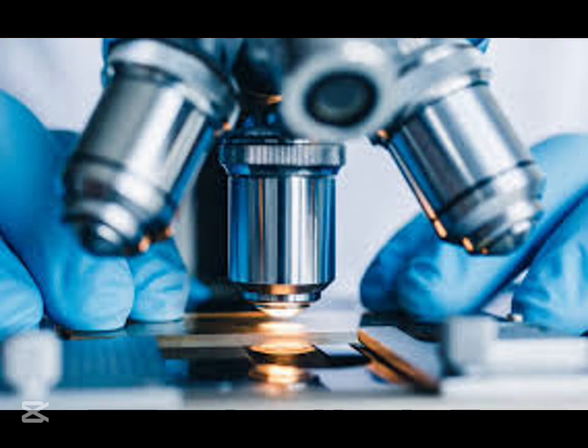That's incredible. It really makes you realize how much is happening that we normally can't even see. Definitely. What about something like a human hair? What does that look like under a microscope? Even a human hair, which feels smooth, under a microscope has all these overlapping scales, kind of like shingles on a roof. Really? You can even see split ends. Wow. I never thought about hair like that. It's amazing how something so normal can look so different under a microscope. What other cool things can we see?